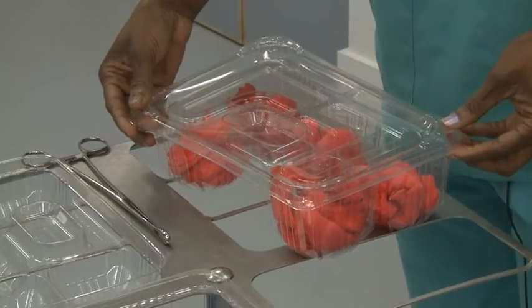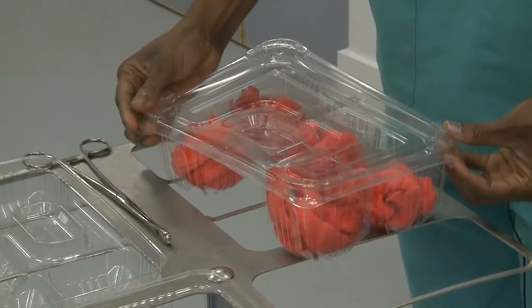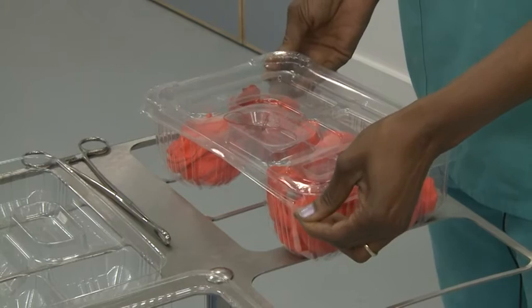Do this by pressing the corners of the lid, without tab, diagonally across the container by lifting slightly as you pull down the lid. Repeat the procedure with the opposite diagonal, using the tab on the lid to seal the lid to the container.